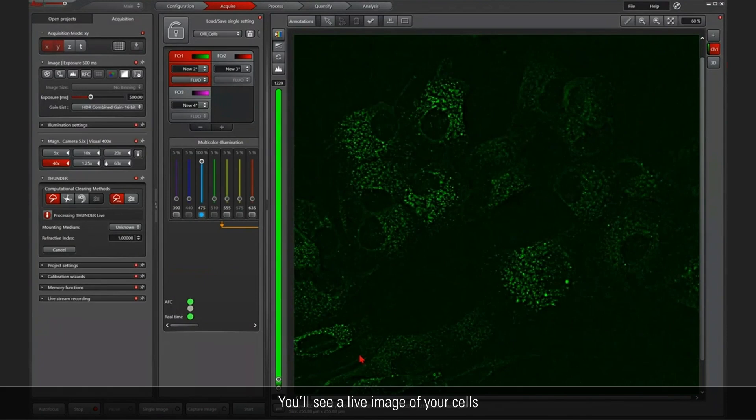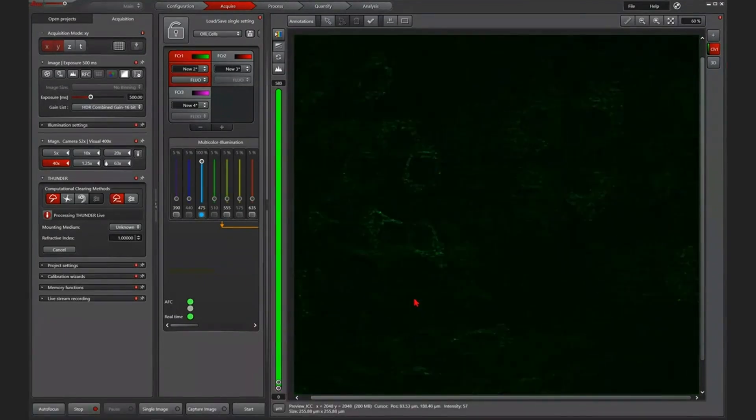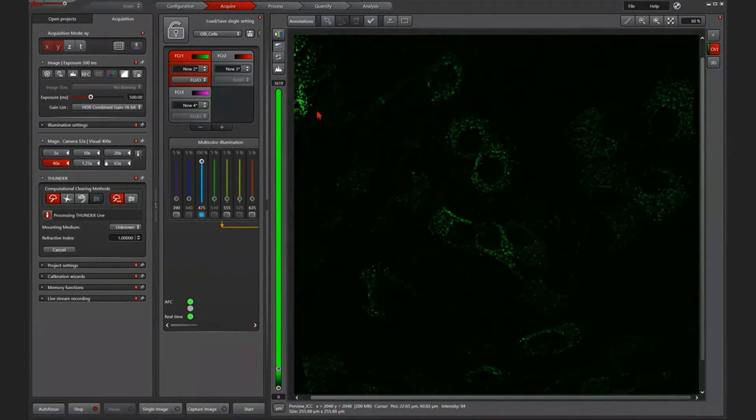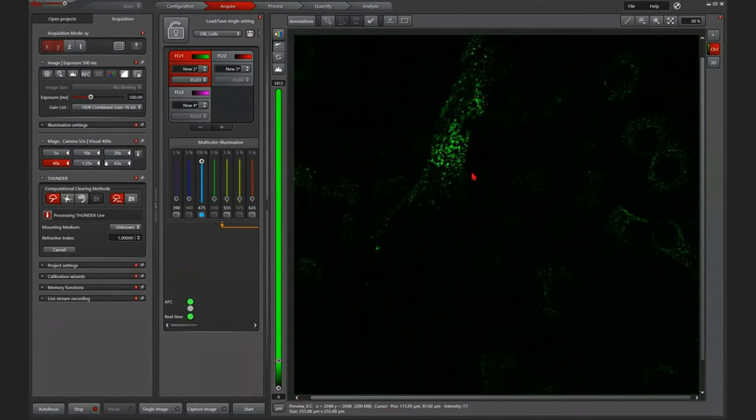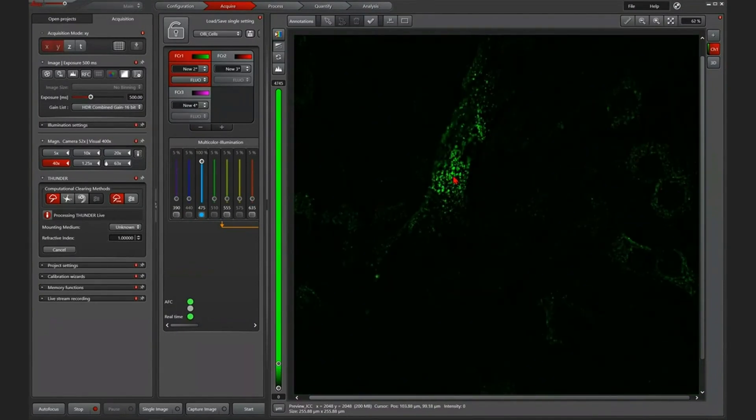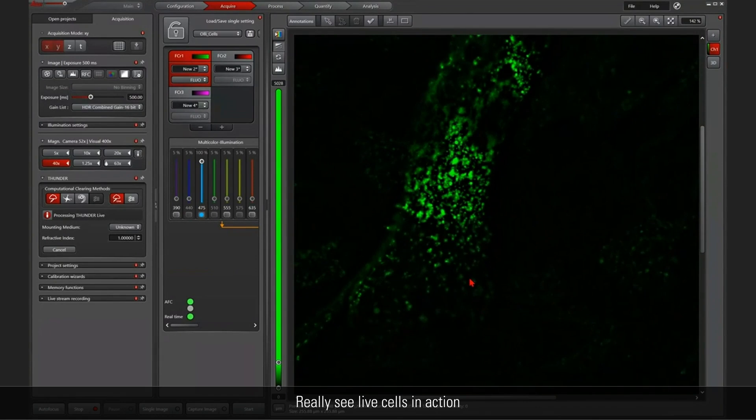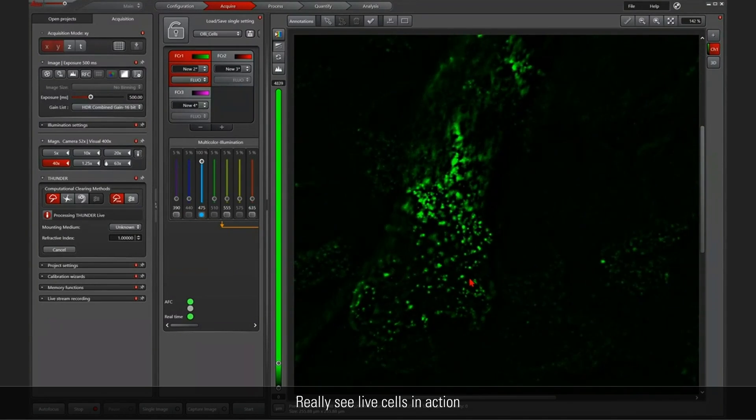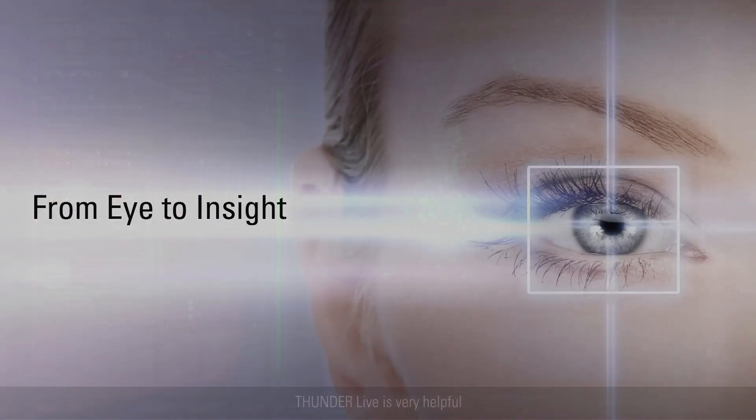OK, and if we just take a look a little bit closer, like here, this one for example. And I zoom a little bit in. You can see these are really live cells and that's why Thunder Live is very helpful.